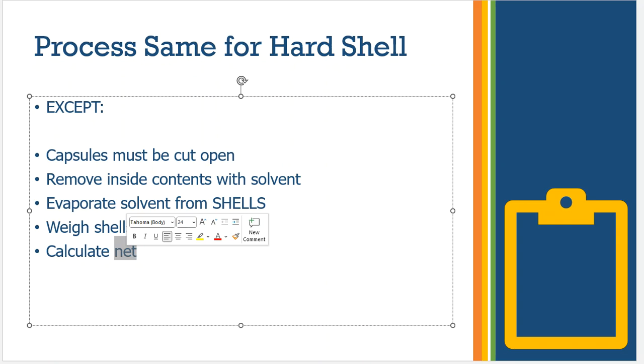So yet again, please, oh please, when I take these 20 tablets, let them all fit and pass within the 90 to 110% threshold. Because if they do, I do not have to cut these open, and I do not have to use solvents, or dissolve those interiors out of the shell, or dry the shell, or weigh the shell, or do the differences and averages of the shell difference, or do that comparison. If the first round passes, we are good to go, and that's what I hope for every single time. But if not, we do another 20.